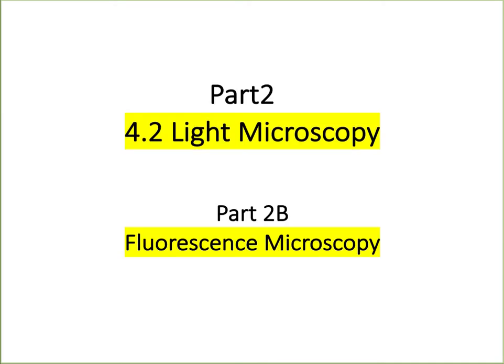In the last part, we ended by talking about some very common histological stains that were used to enhance the visibility of intracellular structures. In this section, we are going to look at a very powerful variation on cell staining. It is used very often in cell biology and microscopy, and it is fluorescent cell staining and fluorescence microscopy.